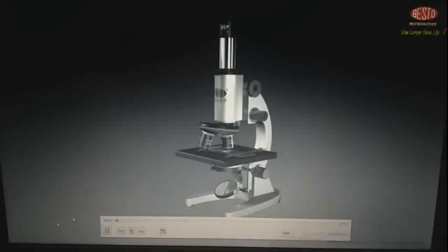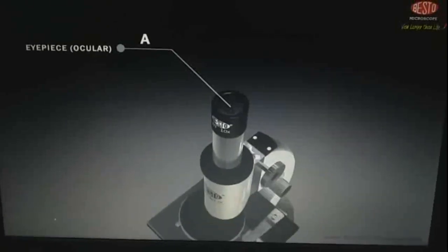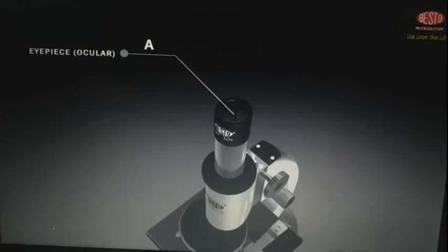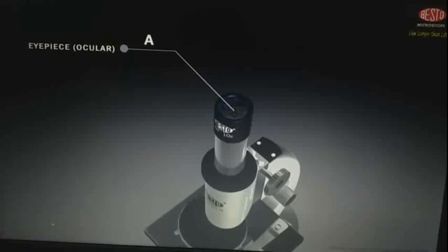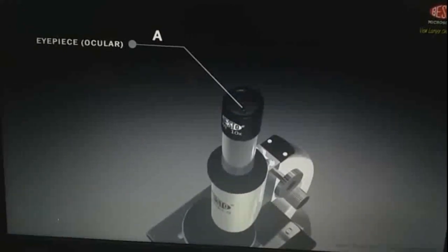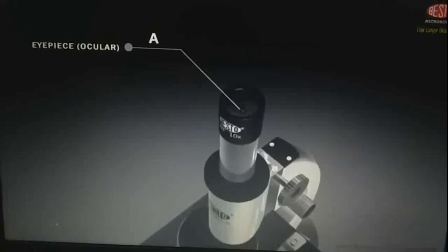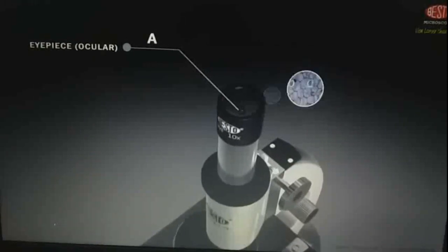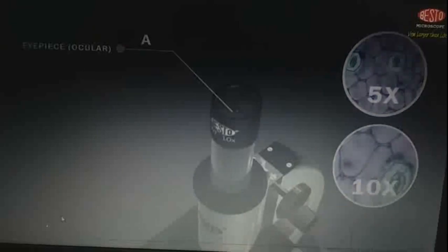Microscope and its parts. A, eyepiece. It is the part of the microscope close to your eyes through which you look. It contains lens which makes the image produced by objective lenses larger. An eyepiece may be labeled with its magnification or power, 5x or 10x, meaning it enlarges 5 times or 10 times.